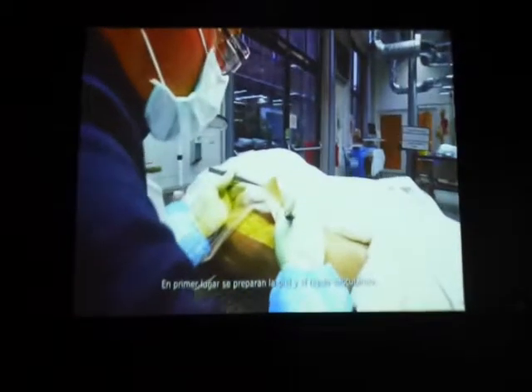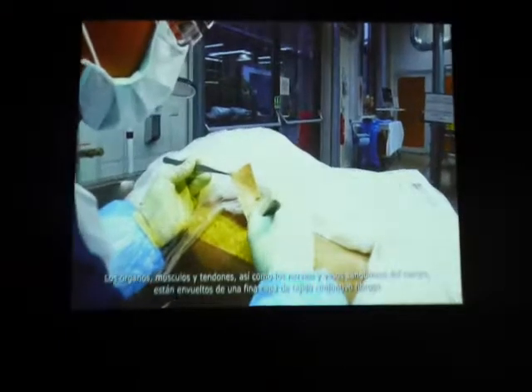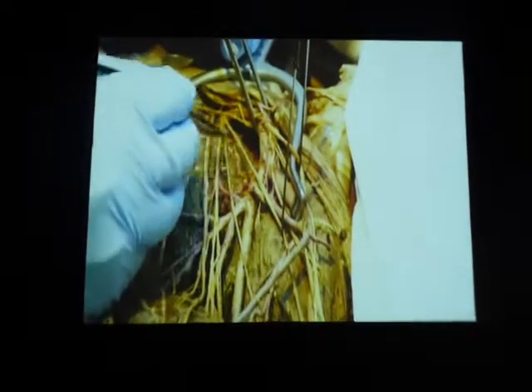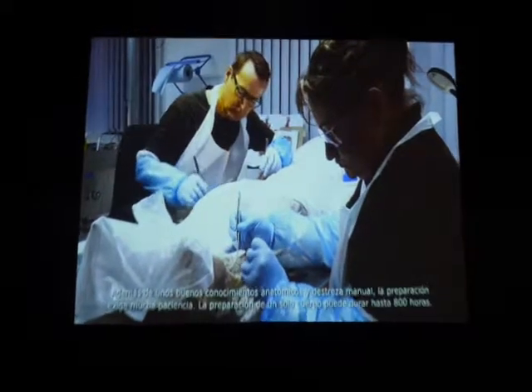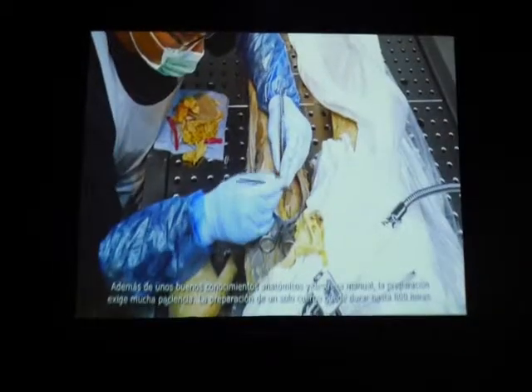First, the skin and subcutaneous fat are removed. The organs, muscles, and sinews, as well as the nerves of the body, are all surrounded by a thin layer of fibrous connective tissue. This tissue is carefully removed with a scalpel and forceps, enabling the individual anatomical structures to appear.